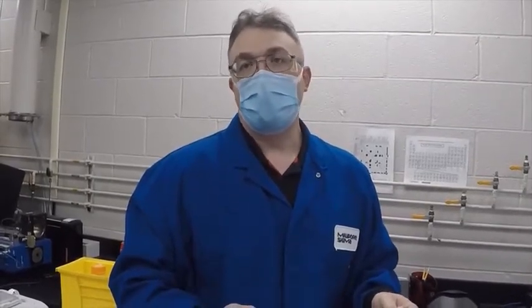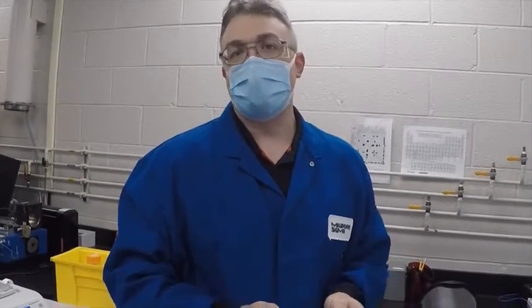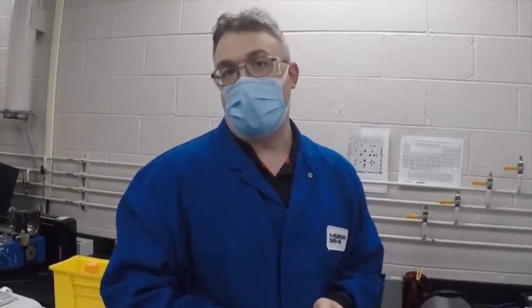Is fit important for a lab coat too? Your lab coat should be a proper size for you. Wearing one that's too big could be awkward to work with. You want a lab coat that's roughly the same size as a typical jacket you would wear in cold weather.